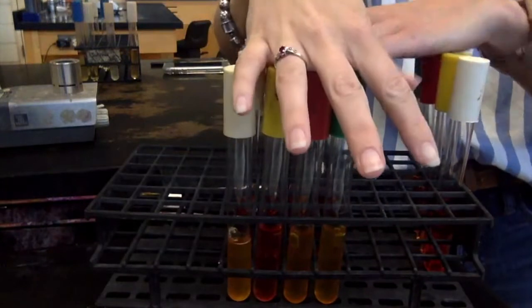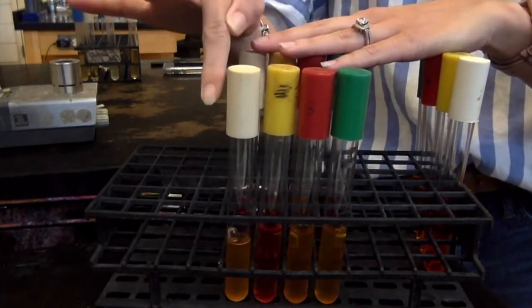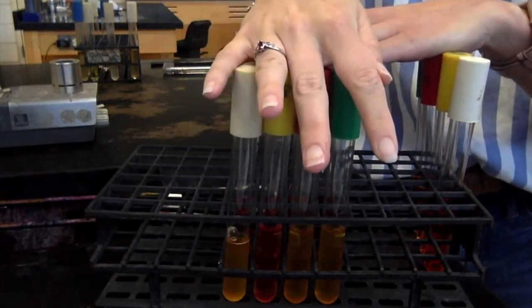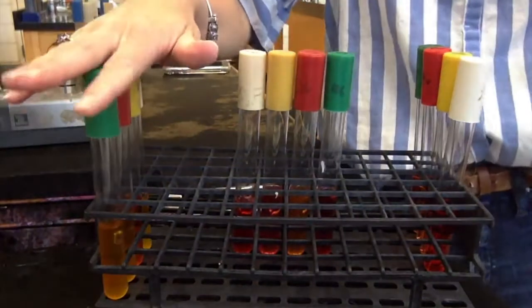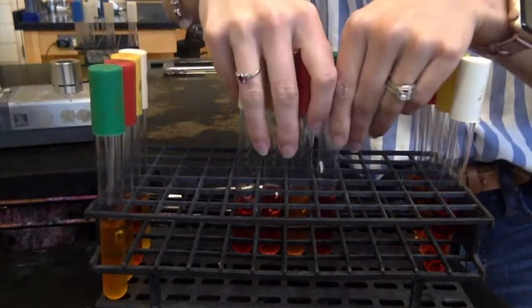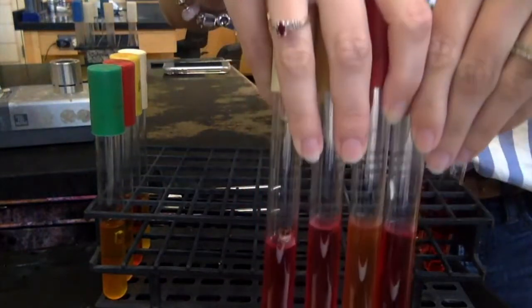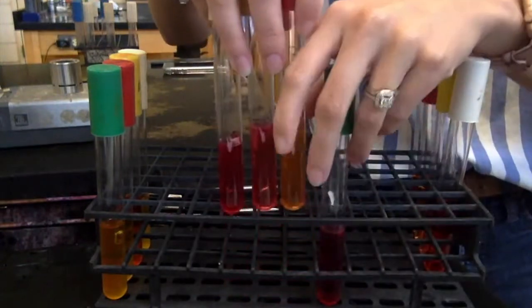So the pattern that E. coli has is positive, positive, negative, positive, with all the positives having gas bubbles. So giving us more information to be able to identify if this bacteria was E. coli or not. Now, if you look at the Pseudomonas, I told you Pseudomonas is a non-fermenter.